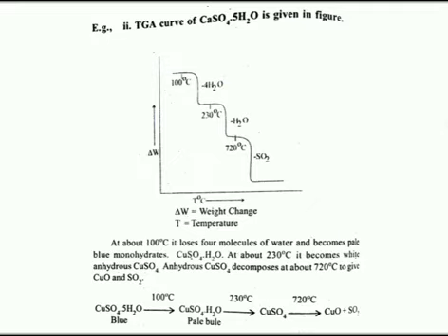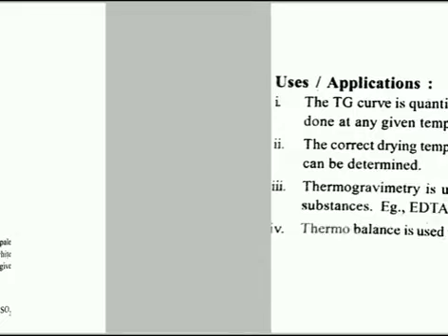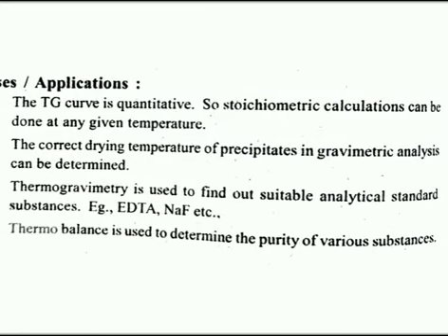Therefore, by studying the TGA thermogram, we can analyze the nature of the sample and the substance, at what temperature it can break, and how stable it is. Next we shall learn about uses and applications of thermogravimetric analysis.